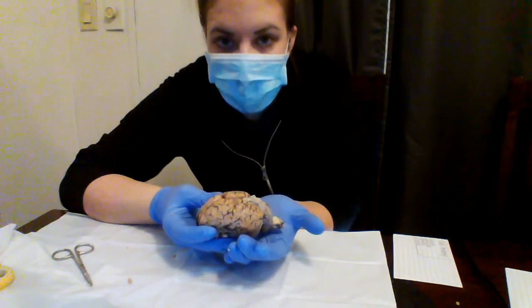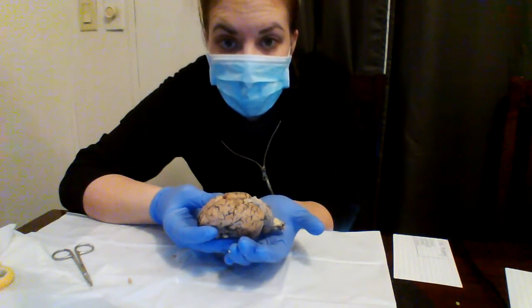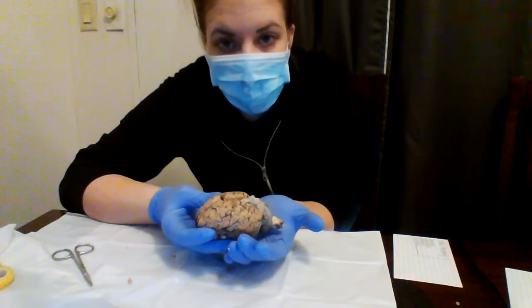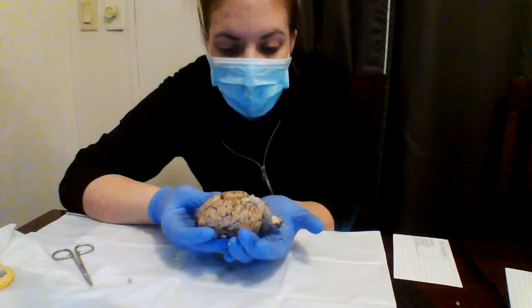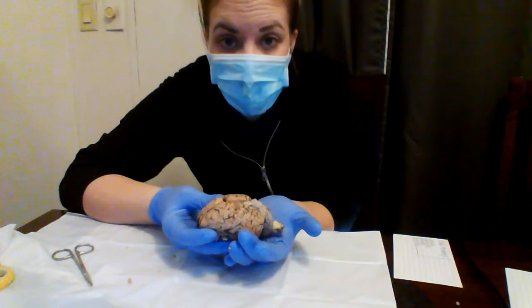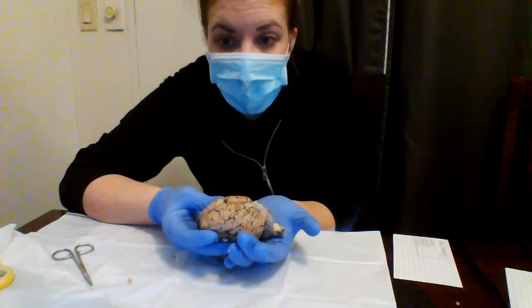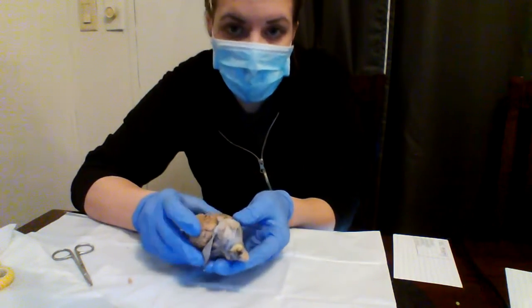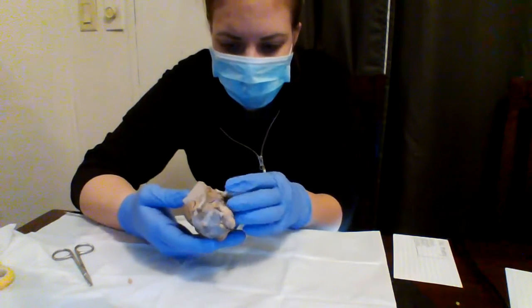They are both very similar in the structures, which is why I do believe we are dissecting the sheep brain, so that we can get the feel of what the human brain is technically without doing a human brain.